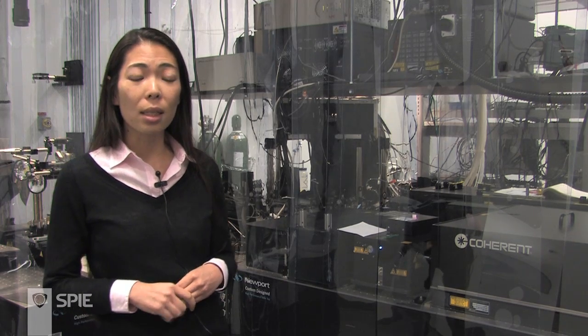The second technology we use is manipulating things in the brain, in our case vasculature, with laser ablation. The key to this technology is high-intensity femtosecond lasers.